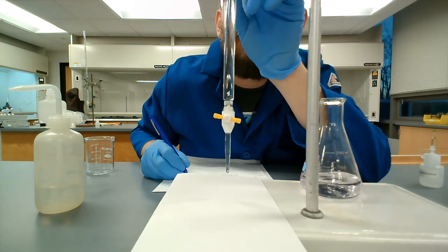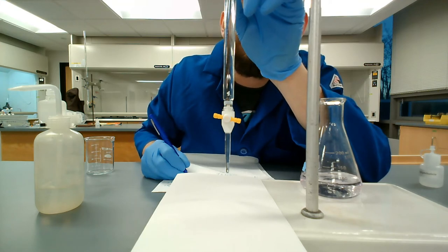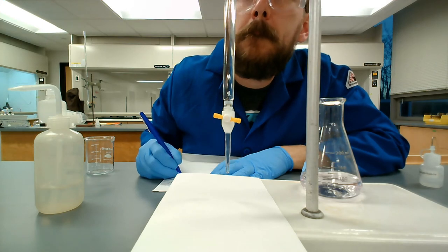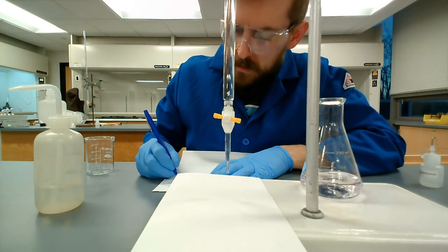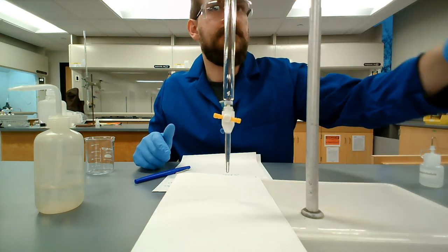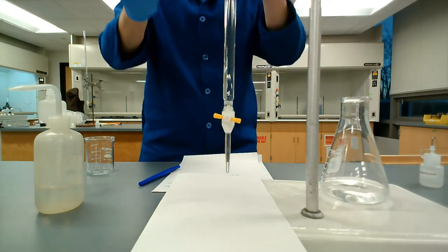Right? I instead got sidetracked. I was trying to demonstrate something in the video. But people will often get close to the endpoint in a titration, and then they'll want to start staring at the Buret readings to try to figure out, like, oh, how close am I? Don't. Just trust your eyes. Focus on the bottom of the Erlenmeyer flask and how quickly you're adding drops, right?